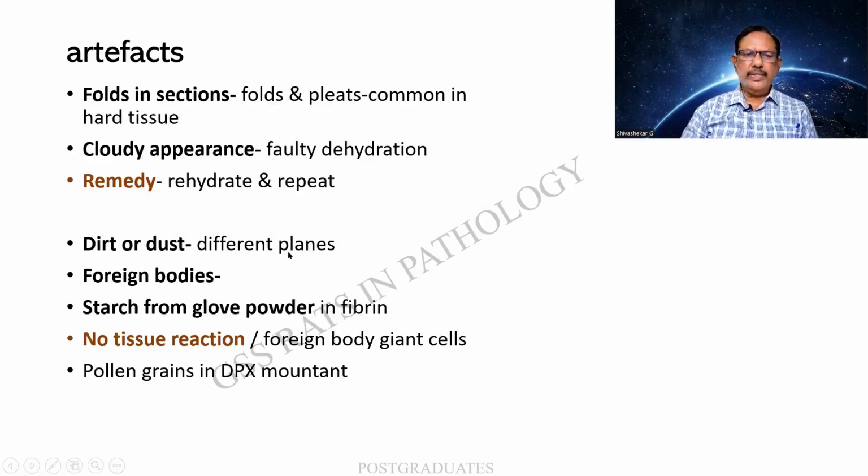Dirt or dust particles, but I'll be able to make out because these are in different planes. Use the fine adjustment: one will disappear, whereas the other gets focused. Foreign bodies, such as the glove powder. But all of this will not be eliciting a tissue reaction. Therefore, I can be sure that they are foreign bodies. Pollen grains in a DPX mountant.